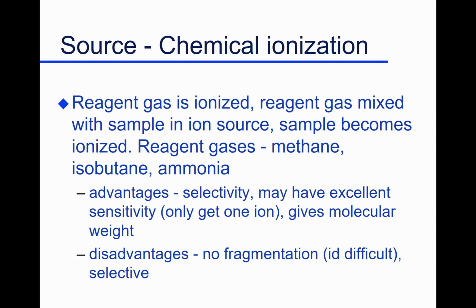Disadvantage is, like I say, it doesn't give us much in terms of fragments. So I get a mass at 165. Well, I'd like to know what it broke into. I'd like to know where the weak bonds are, what they are. So there's pros and cons. One gives good fragmentation. That's nice. Another one doesn't give good fragmentation. Oh, that's nice. It depends on what you're looking for.